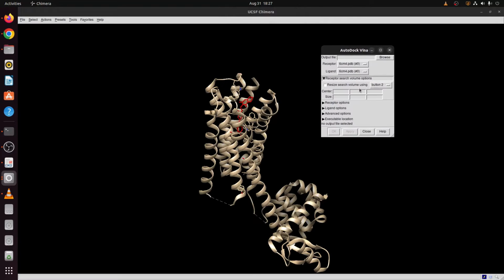Okay, for now you do nothing, don't do any changes over here. Just there you could see these boxes, you just put your cursor over there and put any random number. For now I am just putting a number like 5, tab 5, tab 5, tab 5, tab 5, tab 5. So I have made this. Okay, any random number you can give, no problem.